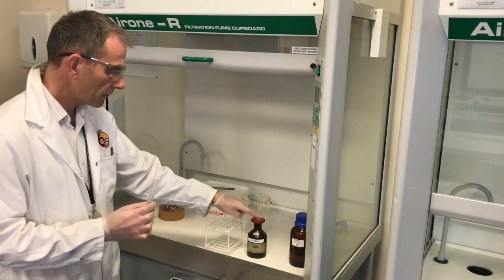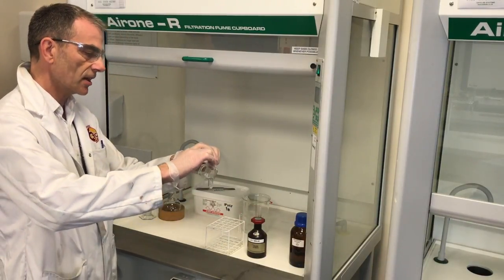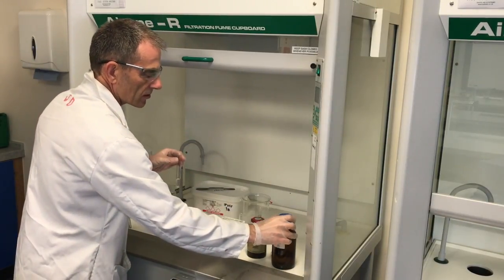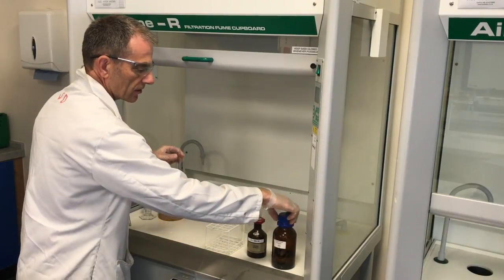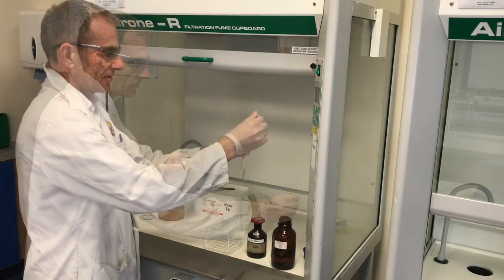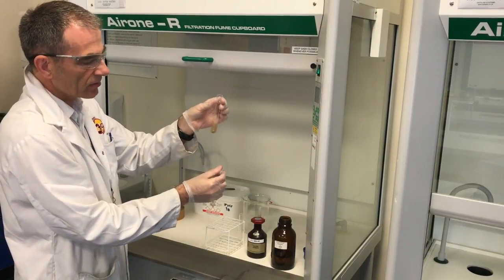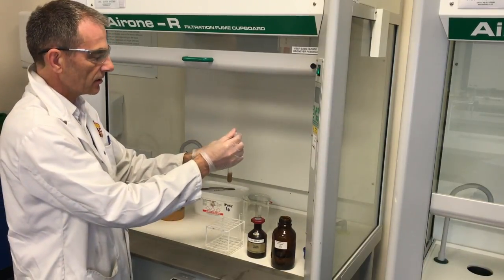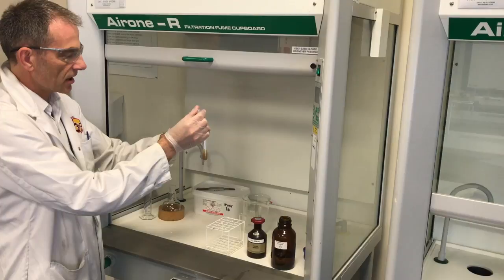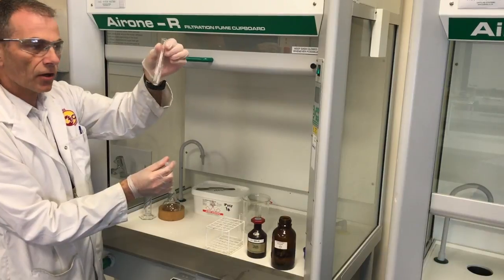The first thing you need is 5 cubic centimetres of 0.1 M silver nitrate solution. I've already measured that out, so that goes into your test tube. We're then going to add some concentrated ammonia solution, just a drop at a time. After the first drop you get this brown precipitate, so keep adding the concentrated ammonia until that brown precipitate goes. It's really important not to add too much.